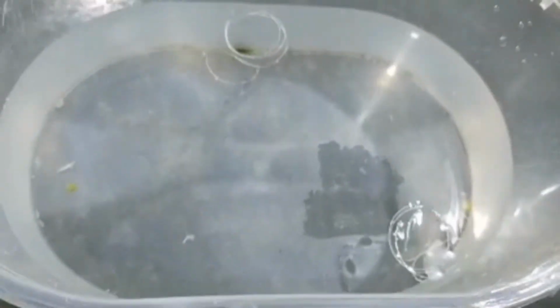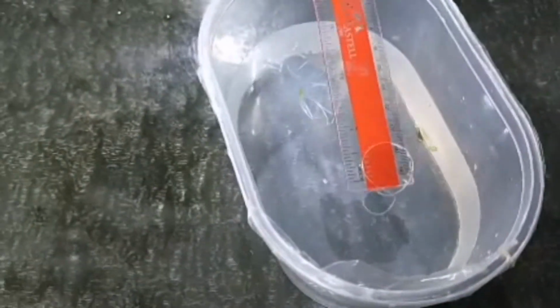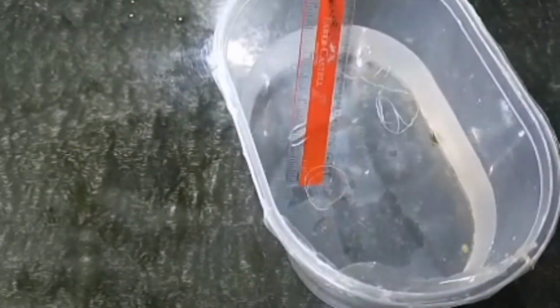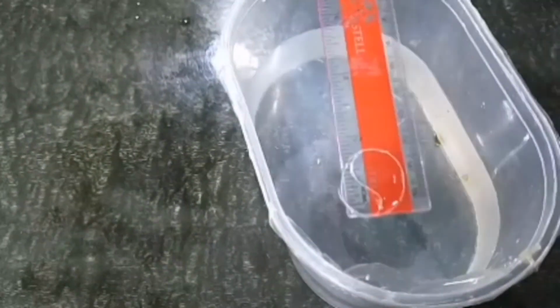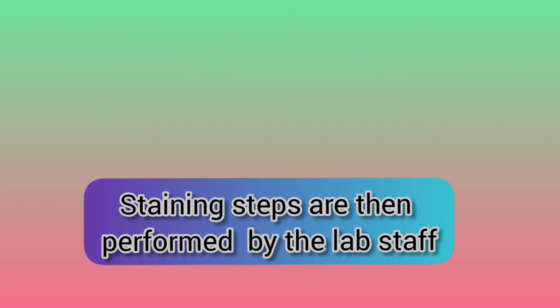Then, take the ribbon and carefully place it in the water bath at 42 degrees Celsius. Pick the ribbon using a slide and then label the slide with the appropriate details. So the slides will be left overnight at room temperature, and then the staining step will be carried out by the lab staff.